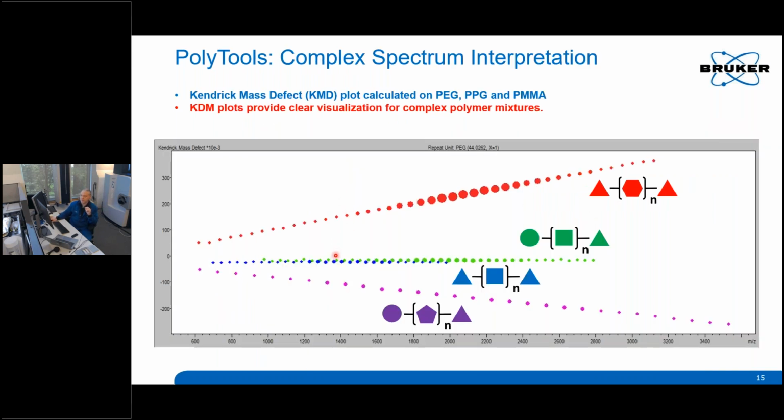But also what we can do is look for things that aren't the same as the polymer that we're interested in. So if you have a blend or a mixture, so here we're searching for an ethylene oxide repeat unit. We see we have two distributions that are polyethylene oxide or polyethylene glycol with different N groups. But also we have other polymers that aren't polyethylene oxide or ethylene glycol in this mixture, and those appear on the diagonal. So the horizontal lines are the ones with ethylene glycol.